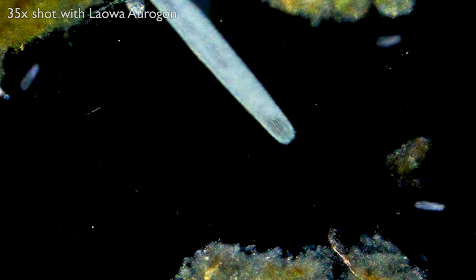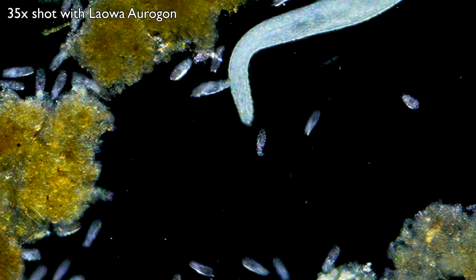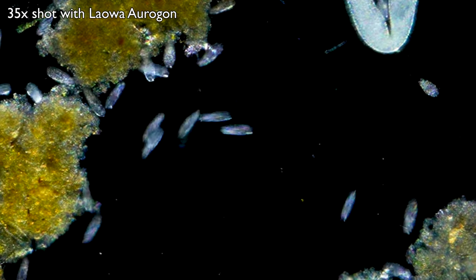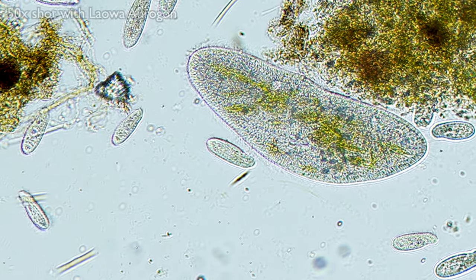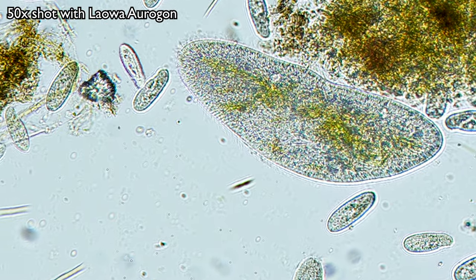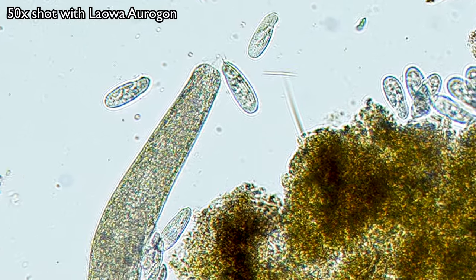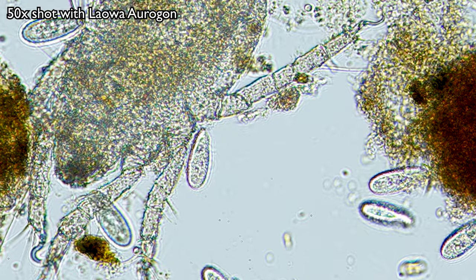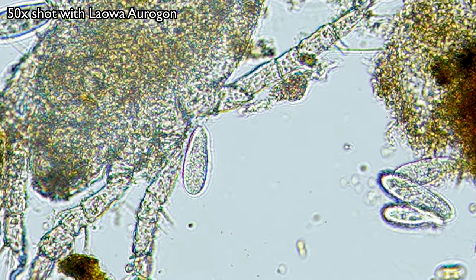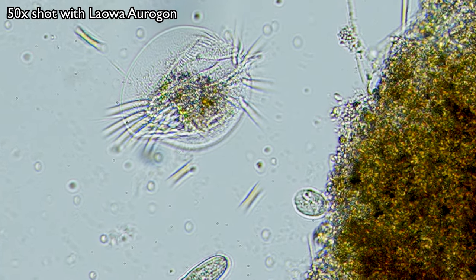These lenses give you a microscope perspective. This is now the 35x magnification objective. It blows my mind that this is a DSLR camera acting like a microscope. These lenses are so powerful you can actually see microorganisms like you would under a regular microscope. I've swapped over now to the 50x magnification lens and you can see the picture is incredible.